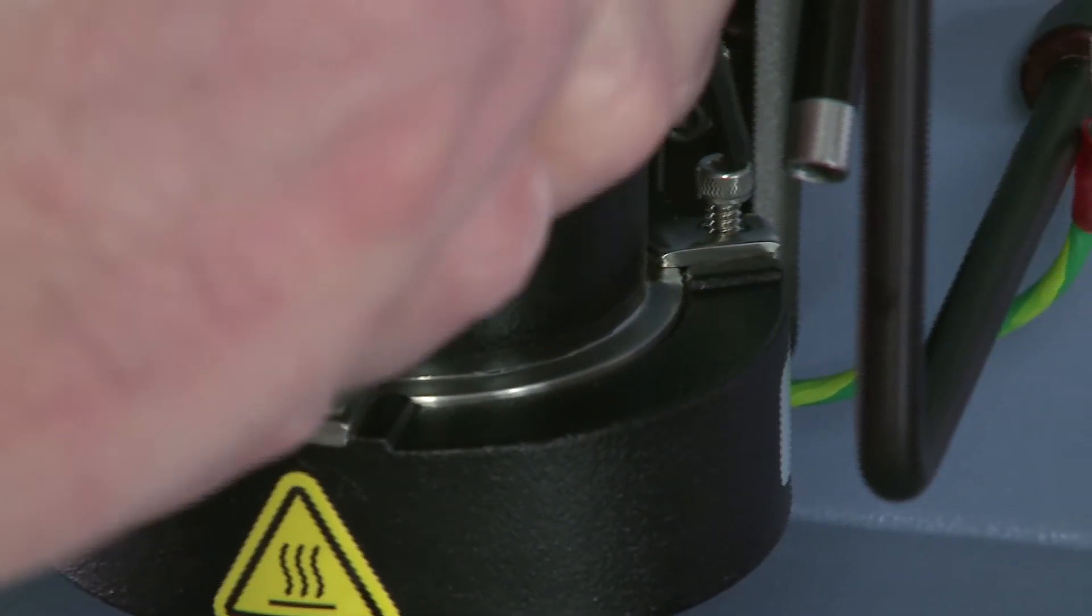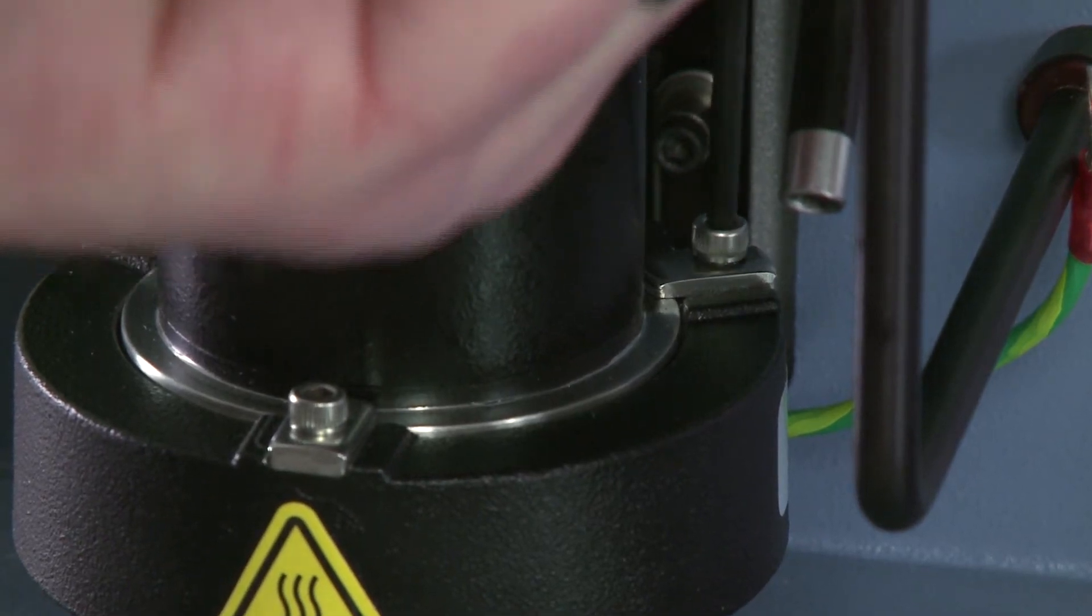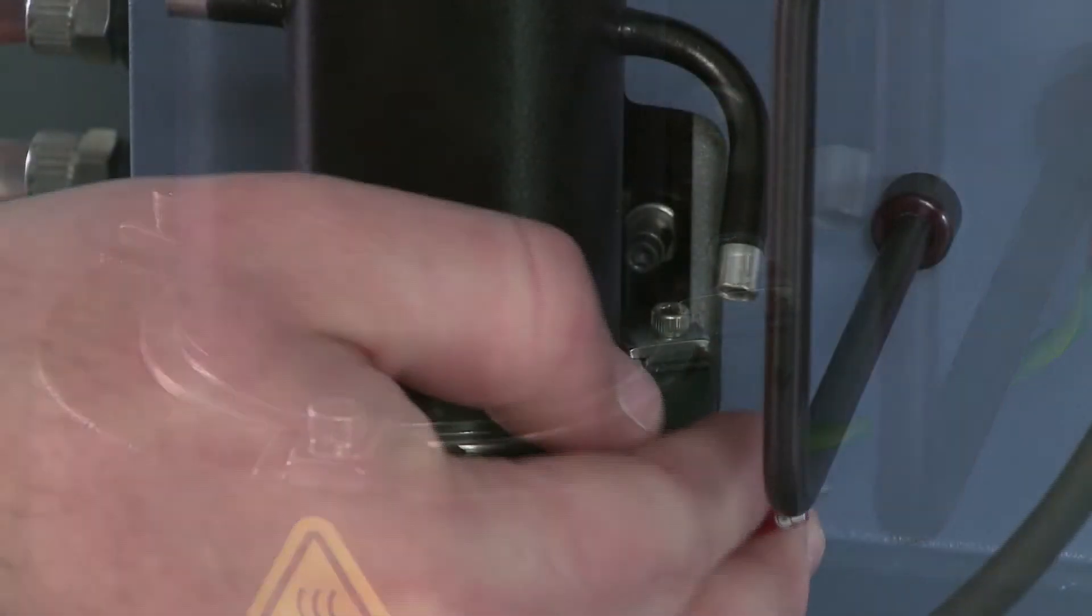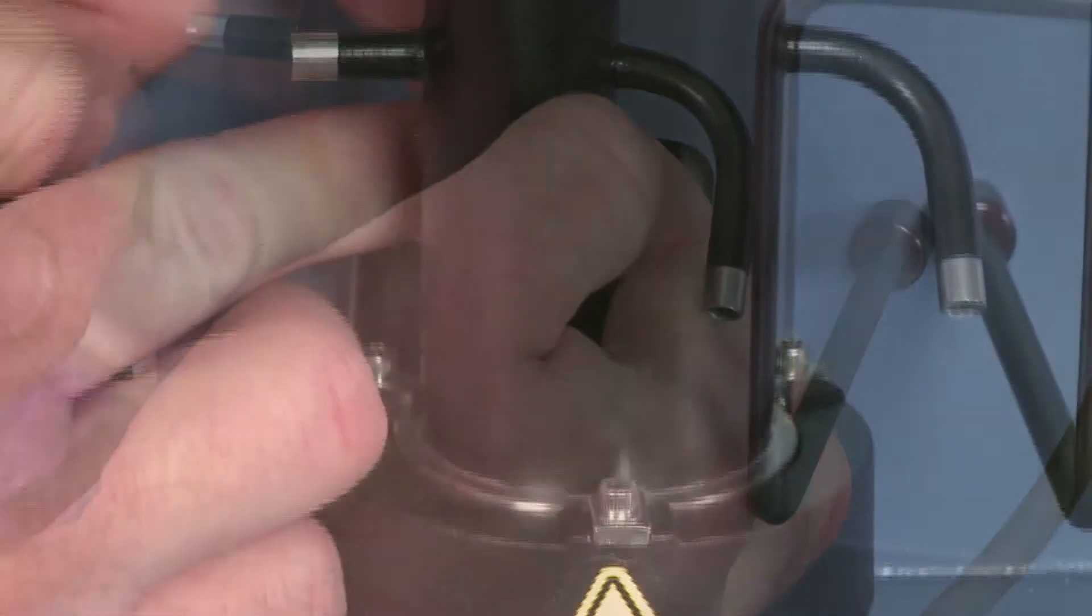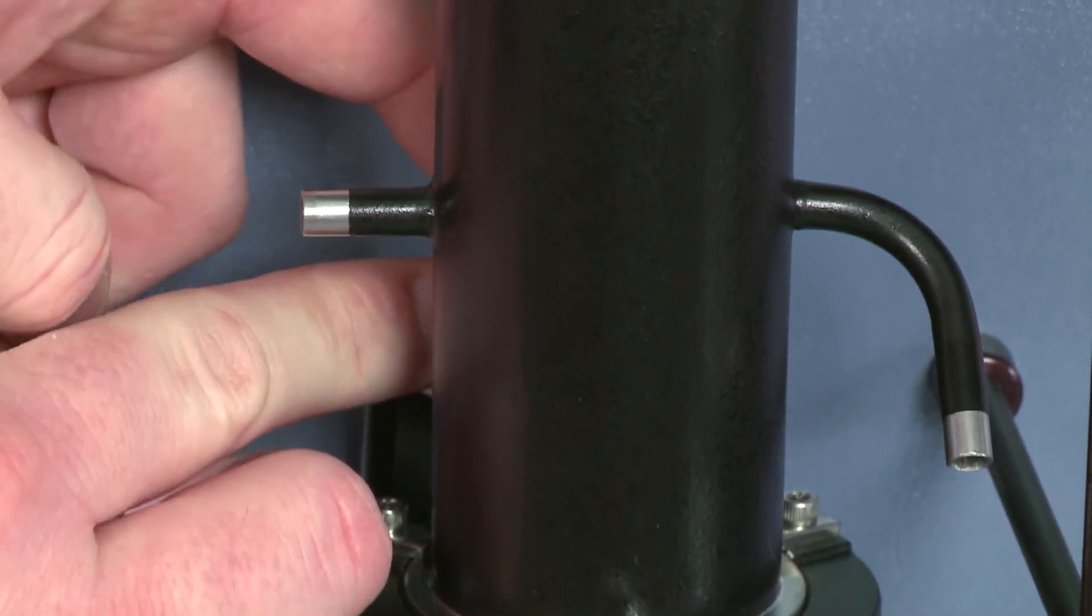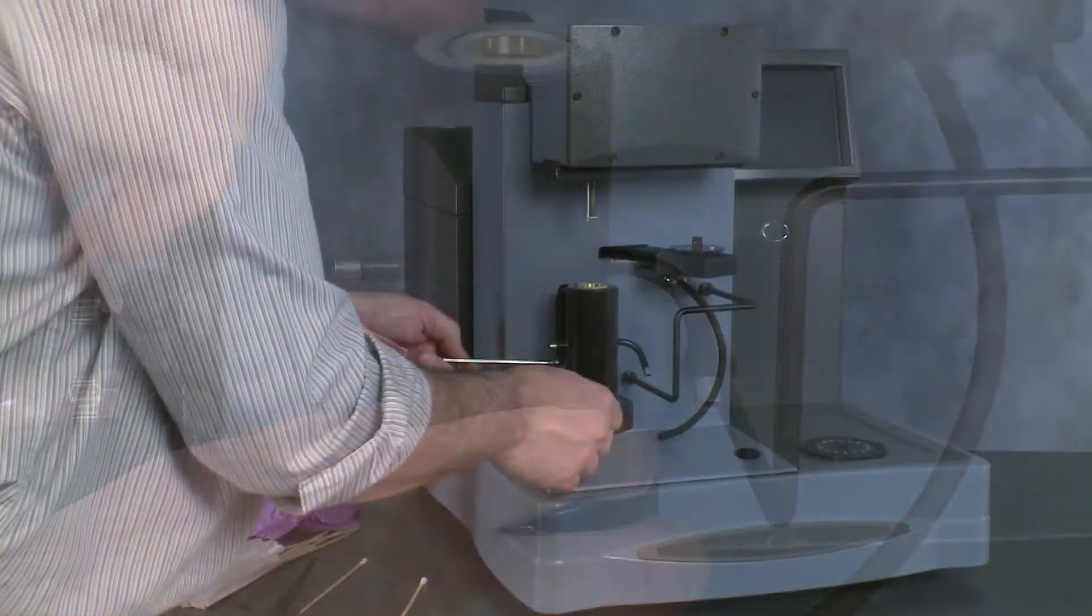Once back in place, we can tighten up the clips fully using the Allen key, replace the earth bonding cable, and replace the nut on the earth bonding cable, which we then tighten up.